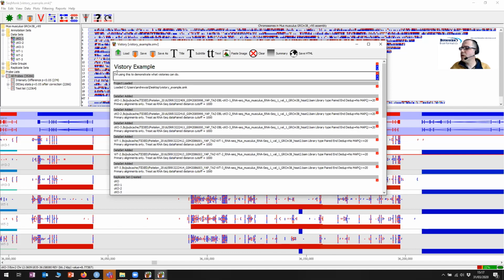We can put as many levels of text and titles into the document. And it's important to do this not just because it sort of enters things into here, but you'll also see that when you generate the report at the end, the titles and the subtitles are clickable sections in a table of contents, so you can quickly leap to any point in the analysis that you have tagged as either a title or a subtitle.